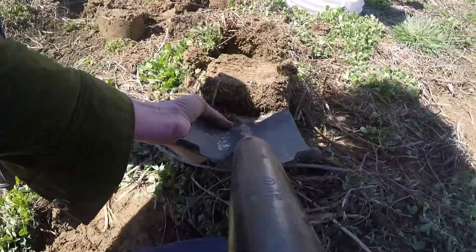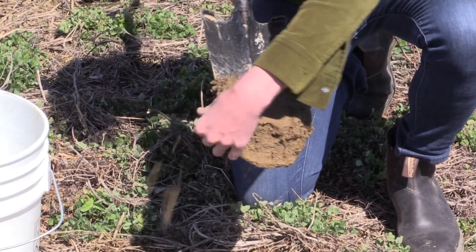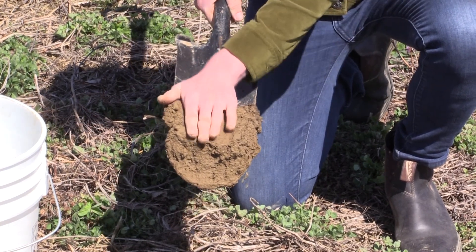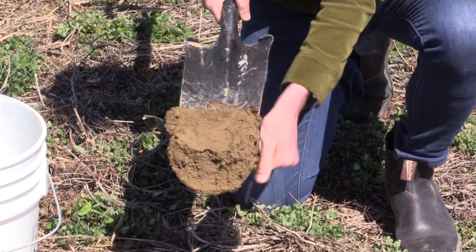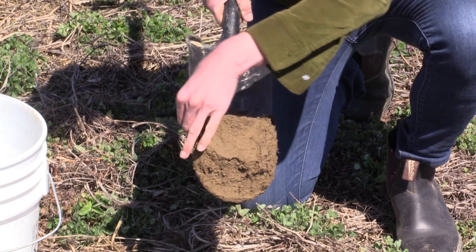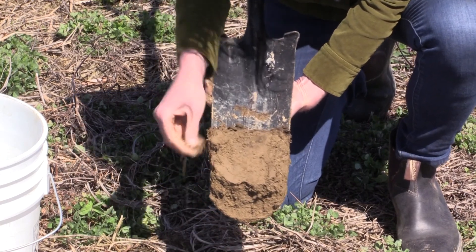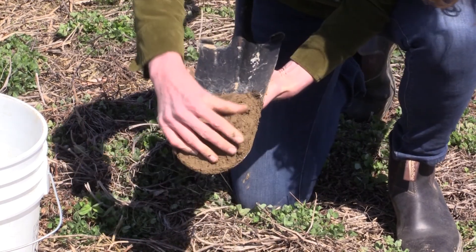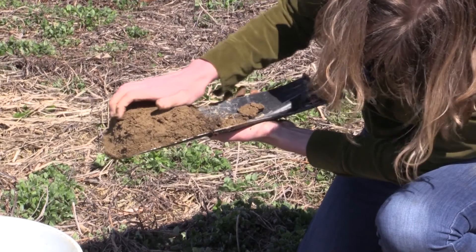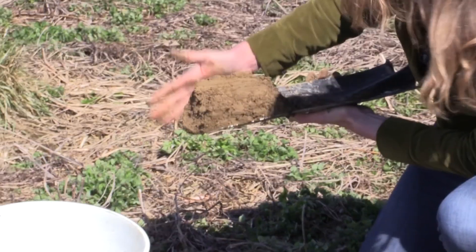We pull it up. It's about perfectly 6 inches deep. Now we're looking for the soil to be consistent — we want to have consistent amounts of soil from the top layer down to the 6-inch mark. So I'm removing any extra soil from the side, looking for that nice even layer. A little thicker at the bottom, just going to even it out a bit. Looks pretty good, about 6 inches.